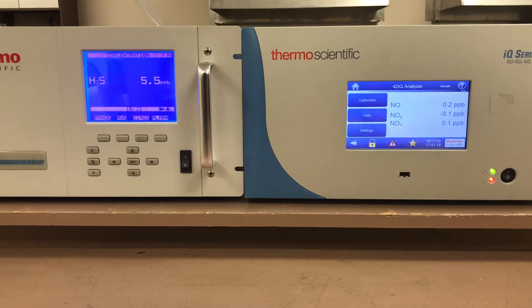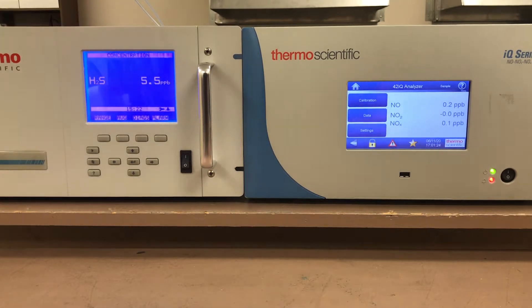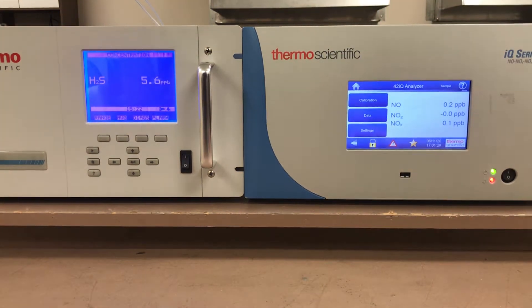Hi everyone, Jim with CDNova Instruments again. Today we're looking at the I-Series Analyzer versus the IQ-Series Analyzer — specifically the maintenance on these instruments, how to do preventive maintenance schedules, how to monitor the maintenance, and how it's done differently between the I-Series and the IQ-Series instruments.